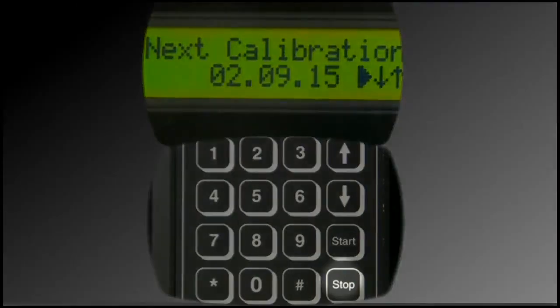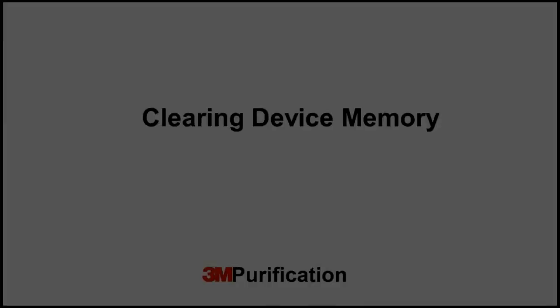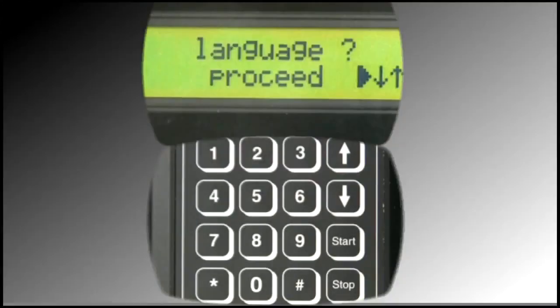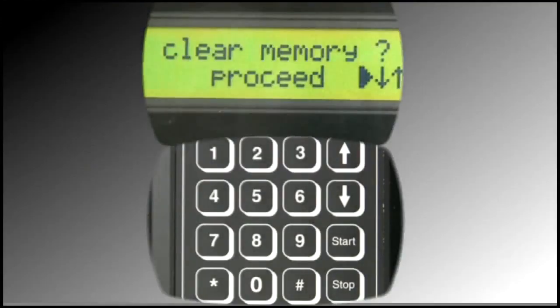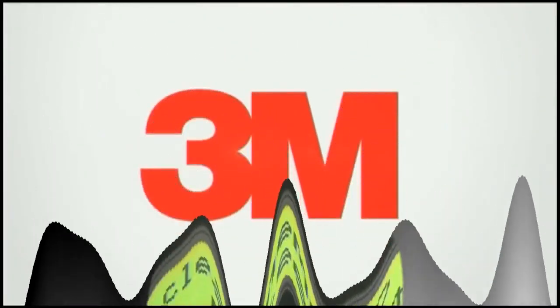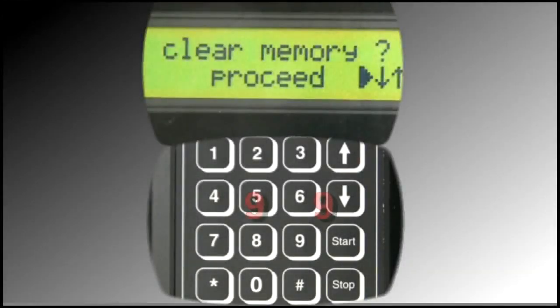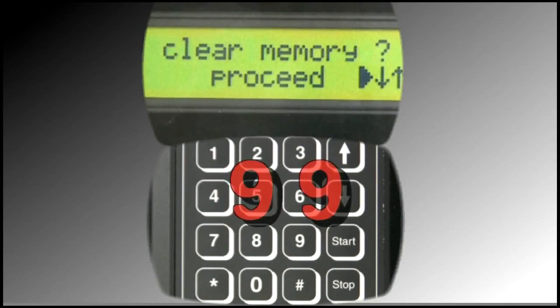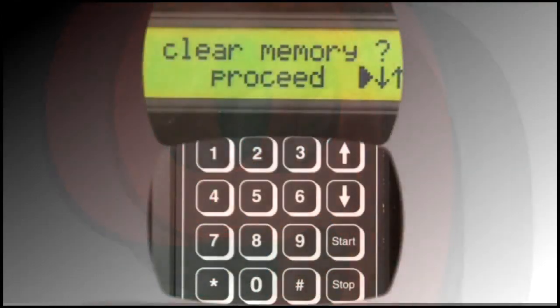Press the Stop button to return to the prior menu. Press the Up arrow four times. This is where stored test results and test programs can be cleared from the device, or the device can be returned to its default unused state if desired. Be advised that the device can only store 99 test results. Any new test results generated will overwrite stored test results from oldest to most recent.